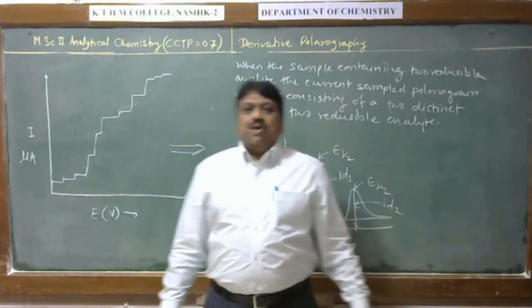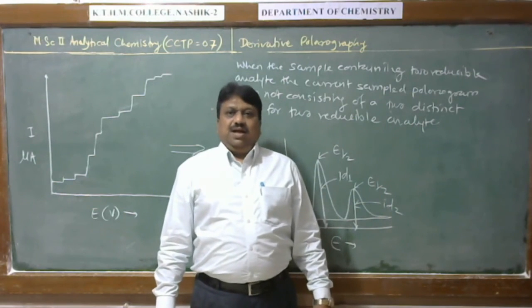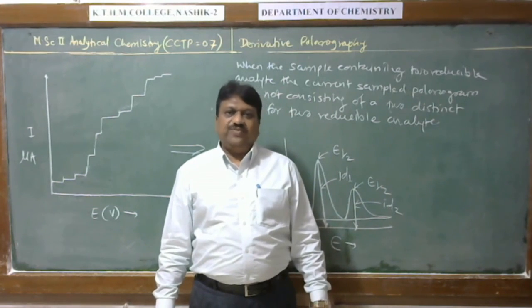Student, this is all about derivative polarography and its advantages in the determination of half wave potential and reduction current of the analyte.